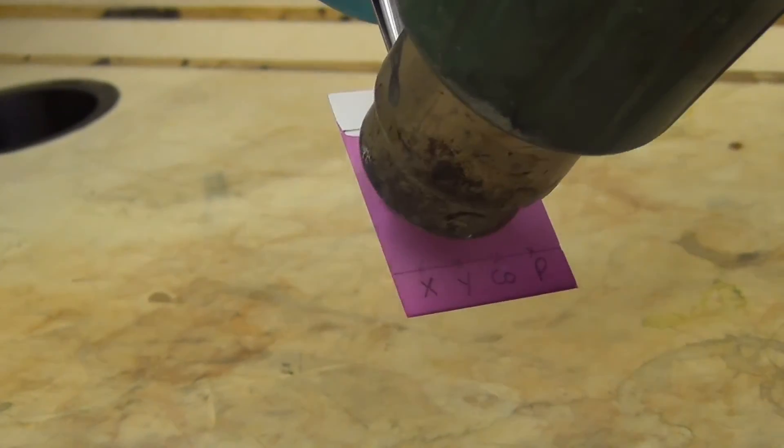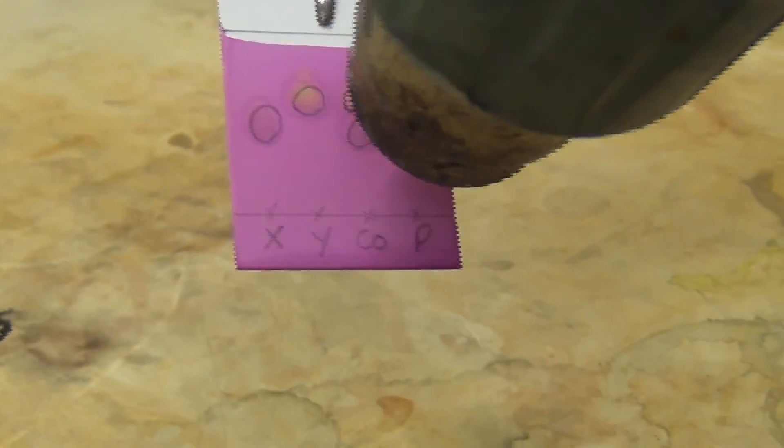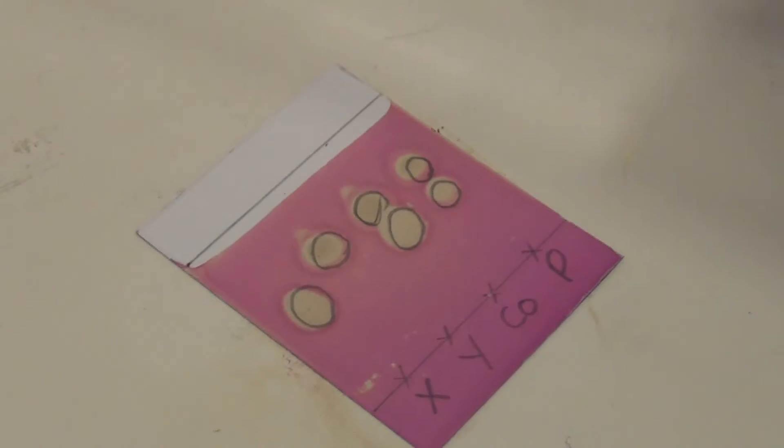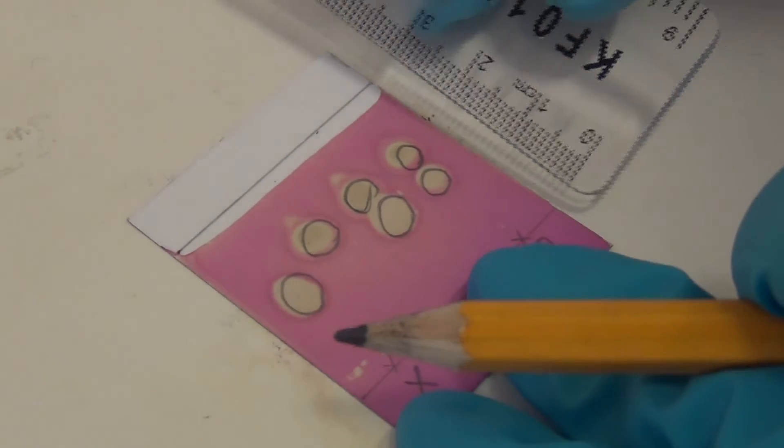The spots will turn one colour and the rest of the TLC plate will turn another, giving us the chance to confirm the position of our spots or to view new spots. By comparing the spots in the channel for mark P with the spots for the co-spot, this plate shows that product P is a mixture that contains more than one compound, and hence is not pure compound Y, and still contains some of the starting material compound X.